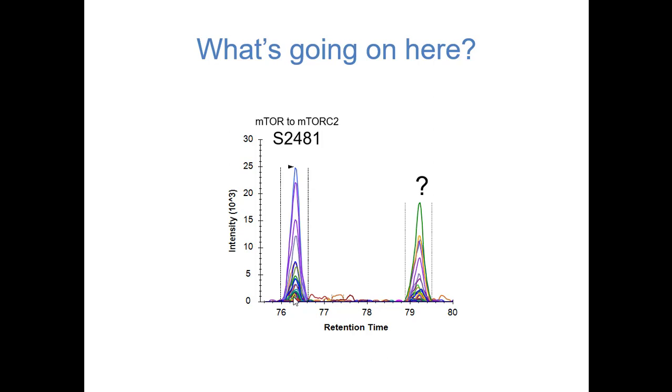I think you're much more likely to see the fragment ions that you're interested in with DIA, and you don't have quite as much of an effect of these mass accuracy issues. The reason why is because of coalescence: with DDA, you just need one peak somewhere to pull everyone off track.